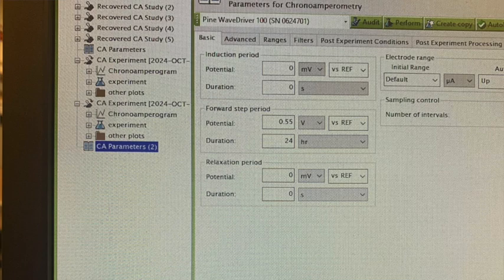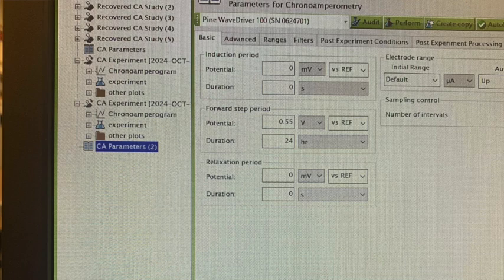Next, you should turn on the potentiostat and open up the aftermath software. You'll open up the CA parameters file and make sure that they are set to zero millivolts versus reference and zero seconds for the induction period. The forward step is all we really care about. In this example, we use a voltage potential of 0.55 volts and a duration of 24 hours, but you should use whatever parameters are necessary for your experiment.